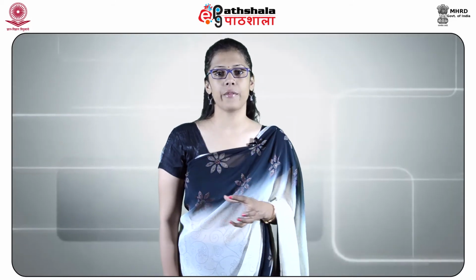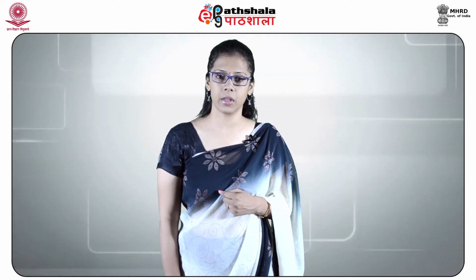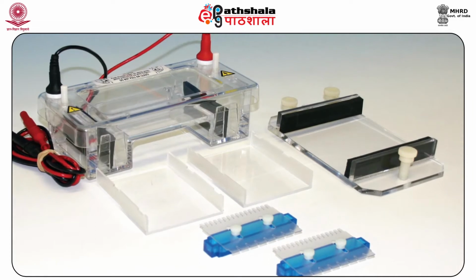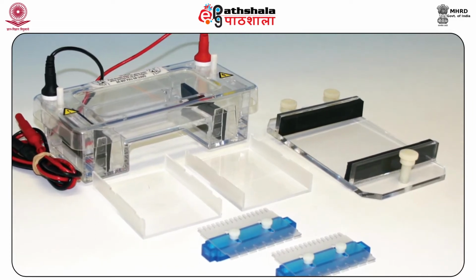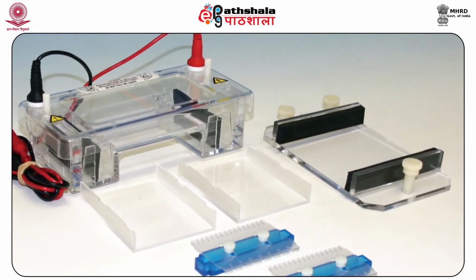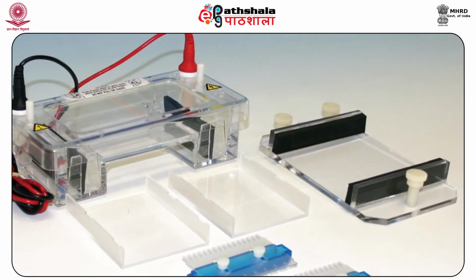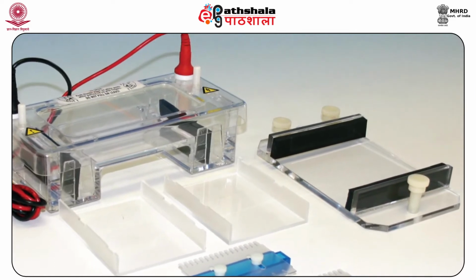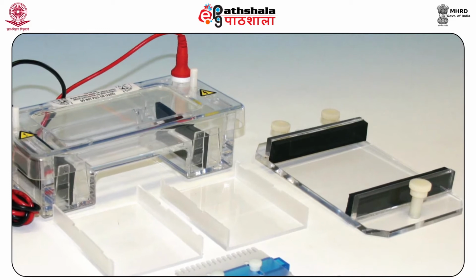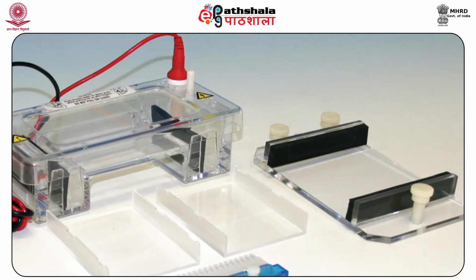An extract of the suspected stain is placed in the cathode well of a gel plate and anti-P30 is placed in the anode well. Electrophoresis is commenced for 20 minutes at 200 volts, forcing the two components together. When the antigen, that is P30, meets the antibody, a precipitin band is formed. The presence of a precipitin band within an extract of an unknown stain proves that the stain contains seminal fluid, that is P30.